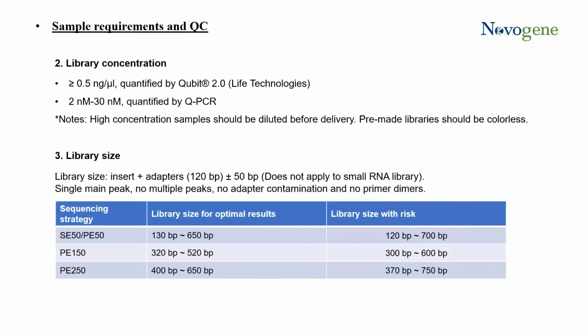All right. So as previously alluded, we already went over the concentration requirements. So please send us anything that is within this range. If you suspect it is a bit above, go ahead and dilute it or just inform us and we can act accordingly. So now we're going to get to one of the most important aspects of your library constructs, and that is the insert itself.